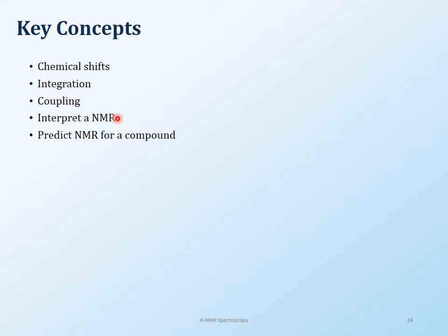I wouldn't worry too much about coupling constants and the complex coupling that I talked about. That was just a little bit more for your information, and maybe in some cases when you're working on an assignment you might see that, but I don't usually ask that on an exam. And of course no 2Ds on the exam.